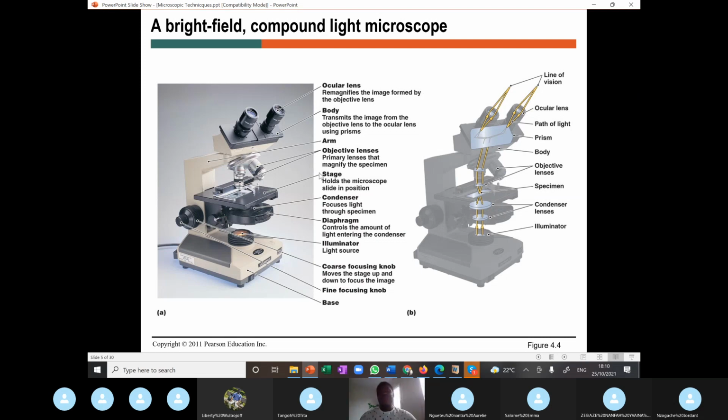And when we're doing typical laboratory practice, I always tell you which magnification to choose. But typically, whenever you have to immerse in oil, whenever you're observing under oil immersion, magnification is by default 100. So you have to select the 100 objective. So the first magnification begins here, and then it's again remagnified here, and you observe with your eyes.